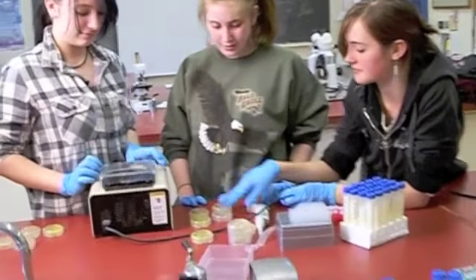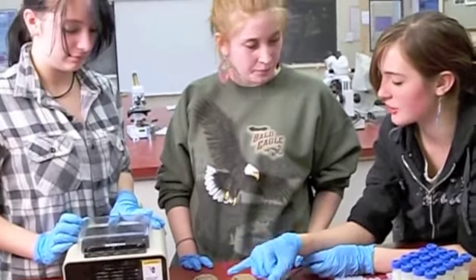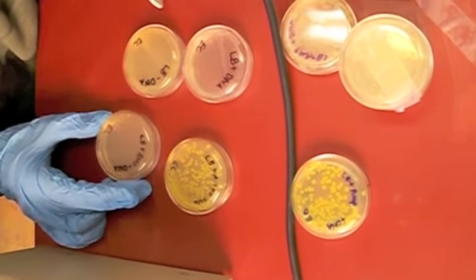And then this one just doesn't have the DNA on the ampicillin plate. So you can see that there's a clear difference between these two, of course. And so without the DNA, you don't have the resistance to ampicillin.